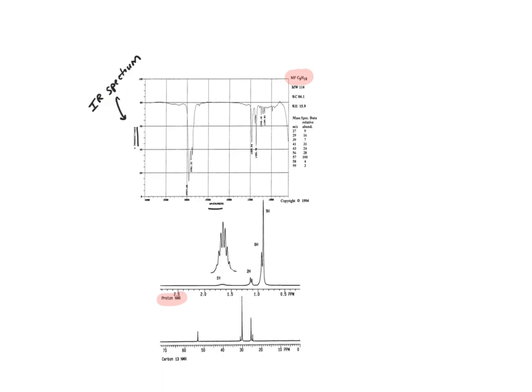Note that in the proton NMR, we're reading chemical shift on the bottom. Again, we don't show you the peak for TMS, but TMS defines what 0 parts per million is. That's been done already by the instrument, so you don't see a peak for TMS. And then we've also given you the carbon-13 NMR data down here. We've also given you mass spec data for the compound, okay? You're not going to actually see the mass spectrum, but instead we'll just get the numbers, kind of like what they do in the textbook.